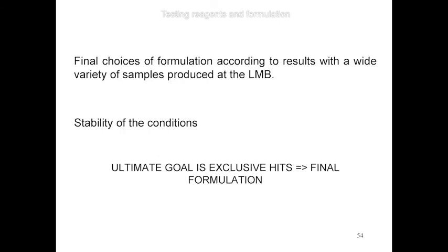Test screens are made available to the users of our crystallization facility, along with many commercial screens. When there are no interesting results with a type of mix or condition, the subsequent test screen will integrate different ones.